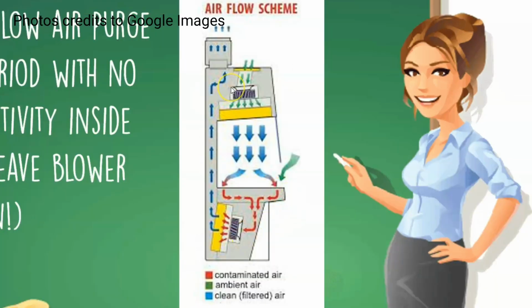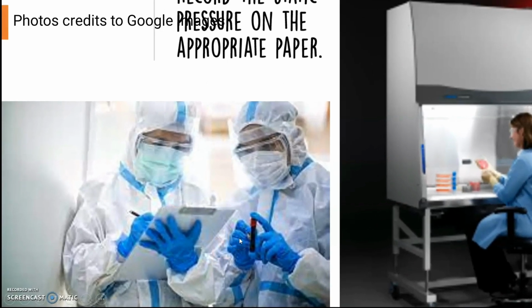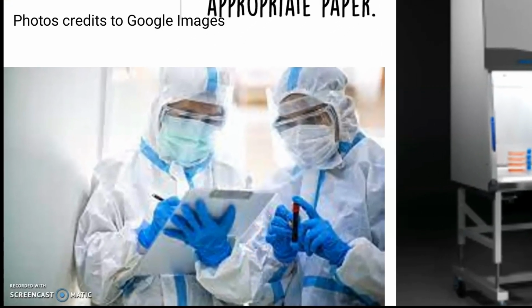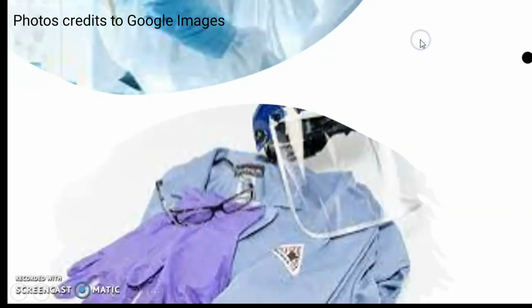So as you can see in this picture, this is the airflow scheme. These red arrows are where the contaminated air flows. We have the ambient air, this is the green one. And the blue ones are the clean or filtered air. You have to record the static pressure on the appropriate paper. It's really important that you record everything that you do here, especially the static pressure.